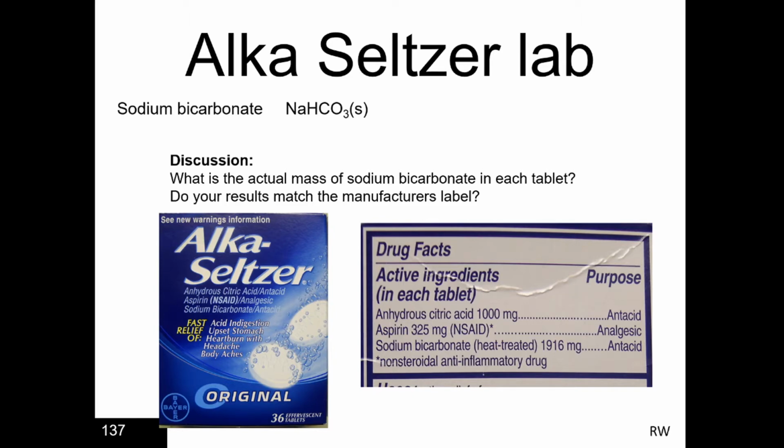All right, so the instructions, the sodium bicarbonate here is this item. The box says it's 1,916 milligrams, but the question here is, can you prove it? If you imagine you were working for the FDA and your job was to determine if this company was honest in their labeling, so it was your job to design an experiment to prove that the sodium bicarbonate, the NaHCO3, was in fact 1,916 milligrams in each tablet.